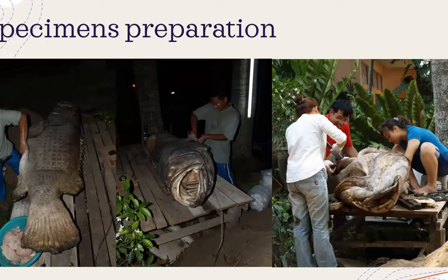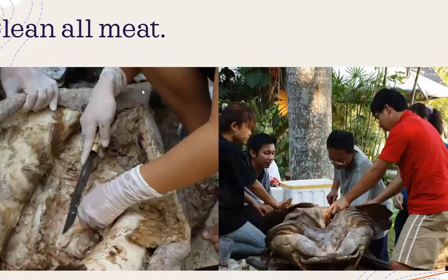Then when we cut like this, it's easy for me, and so many students can help me with the fish. Okay, we can open from that, and many of them can use it step by step. And how to do it: the fat should be removed.